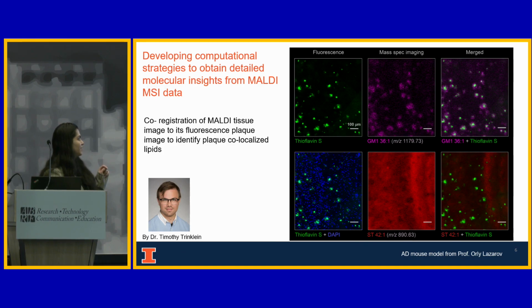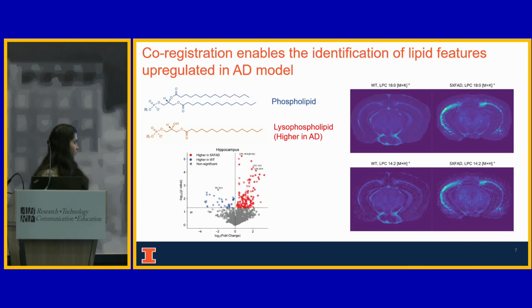And here you can see a large amount of aggregation where the plaques are. But in the bottom picture right here, what you see is a depletion of a specific sterol lipid. So you can see depletion of this lipid where the plaques are formed. So we can get this spatial distribution of lipid metabolism and lipids in the plaque region using this strategy.